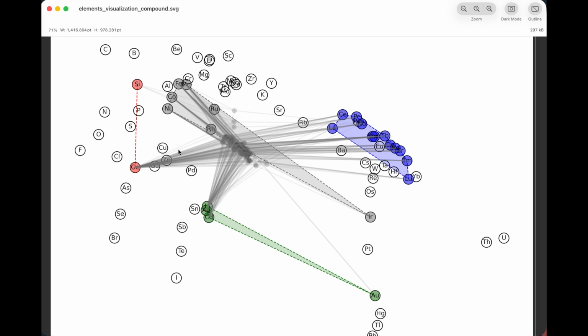And the gray line shows the connectivity. So you can see all of the compounds belonging to this structure type are clustered here. So what this gives us is an opportunity to compare a new compound using this coordinate.